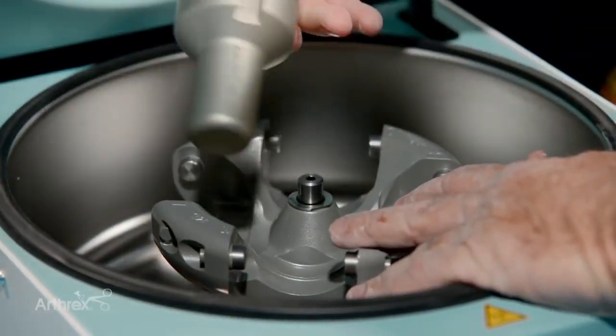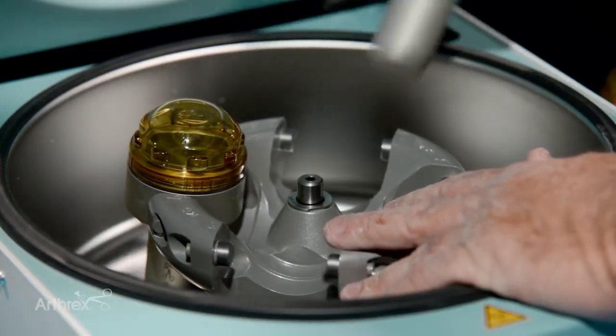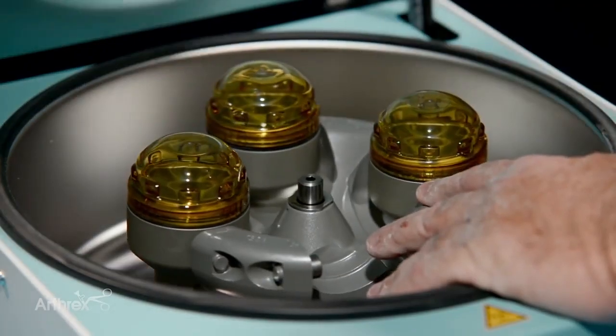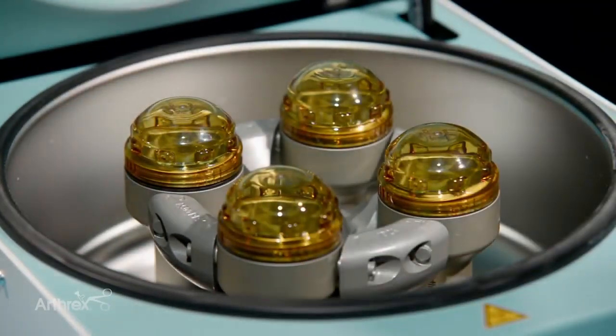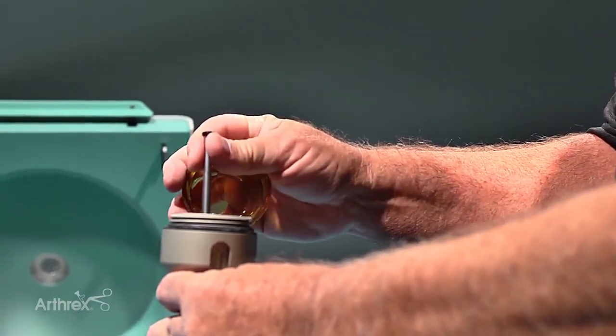Okay, so then we introduce the buckets for the ACP. They're a swing-out rotor. It's 4, depending on how many products of ACP or how many samples of ACP. If it's an odd number, you're always going to have to counterbalance. In this case, we have just 1 sample. So we're going to take one of the buckets and put the counterbalance inside.